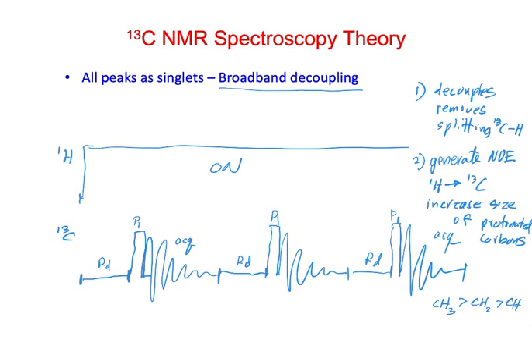All right. So there are other ways to do this decoupling as well. This is one reason for unequal peak heights.